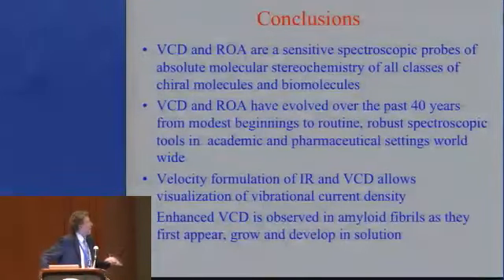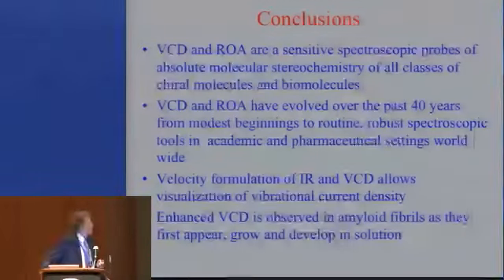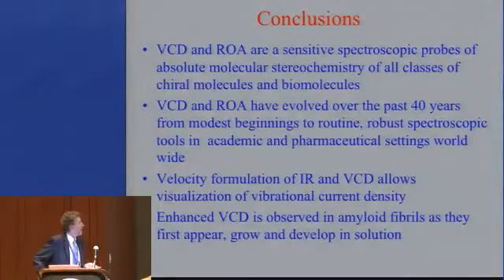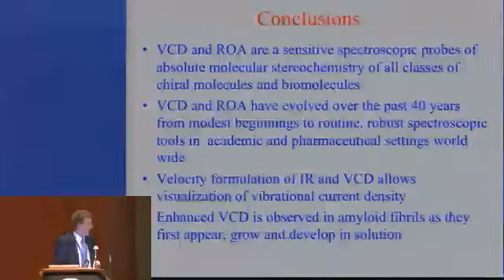So I'm just going to close with the following conclusions, that VCD is a sensitive technique for all kinds of stereo classes of molecules. VCD and ROA have evolved over the past 40 years from modest beginnings to routine spectroscopic measurements in academic and pharmaceutical and other areas. I showed you a little bit about velocities and a little bit about enhanced VCDs.